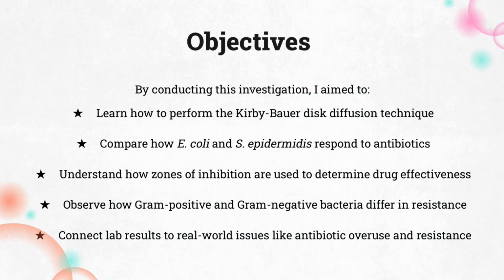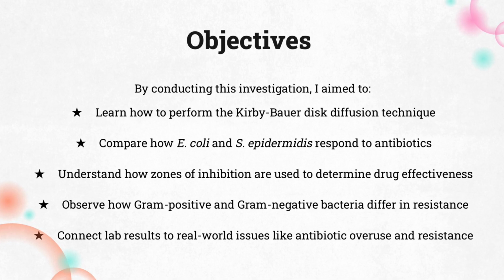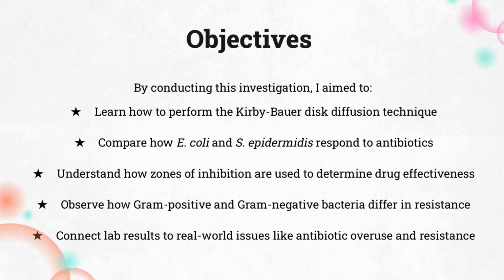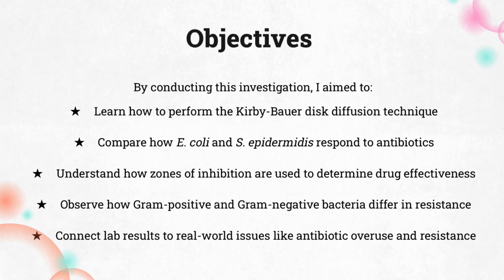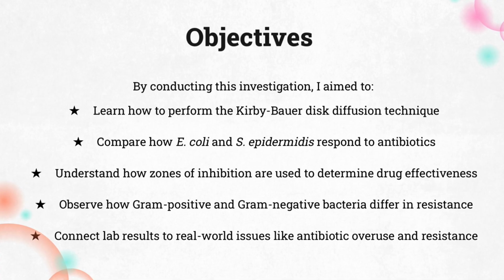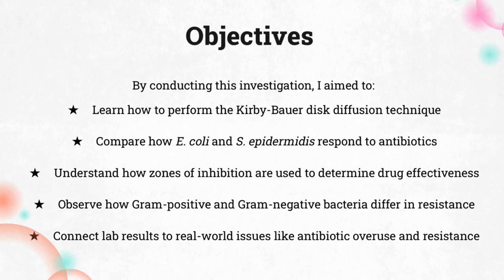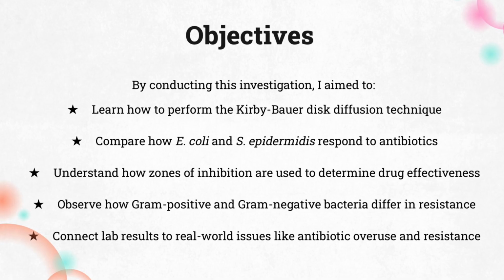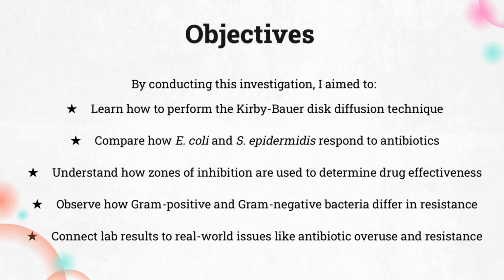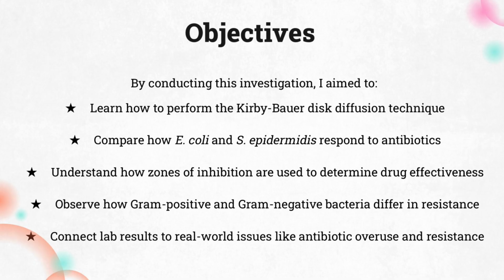Now onto the goals of my investigation. I wanted to learn how to properly perform the Kirby-Bauer disc diffusion technique, compare the antibiotic response of the two bacteria, E. coli and Staph, use zones of inhibition to determine antibiotic effectiveness, understand how gram-positive and gram-negative bacteria differ when it comes to resistance, and finally connect my lab results to real-world issues like antibiotic overuse. And spoiler alert, it was really interesting to see how much bacterial structure impacts antibiotic success.